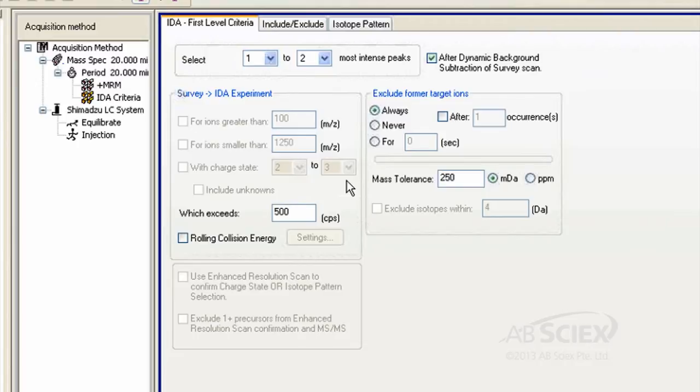And finally, set your Exclude Former Target Ions selection to Never. This just means that you will always trigger an EPI even if the peak had been previously detected in your chromatogram. You can leave the mass tolerance setting as the default.